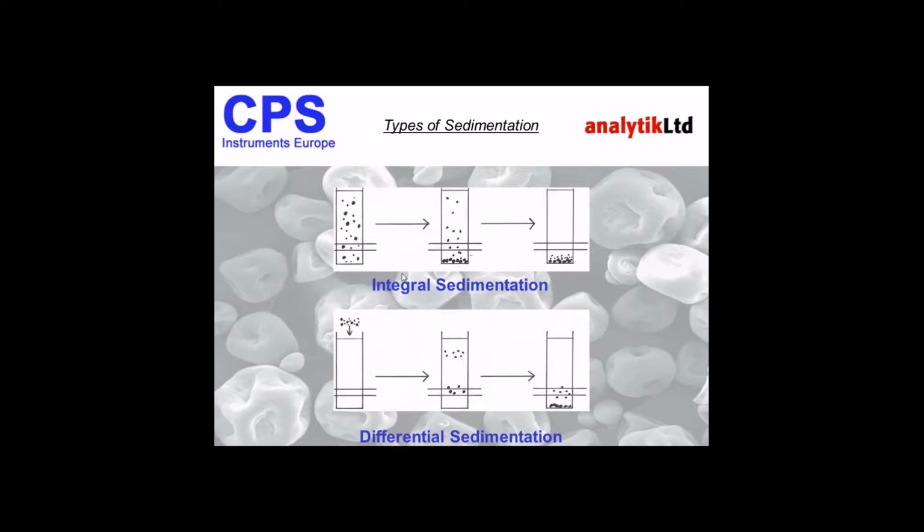Now, there are various problems with this type of sedimentation. I won't go through all of them, but the significant ones are that the conditions of the analysis are very difficult to characterize, including any change in fluid temperature. Also, the chamber must be emptied and cleaned following each sample. So you can't run sample after sample, and you also cannot run a calibration standard in between.